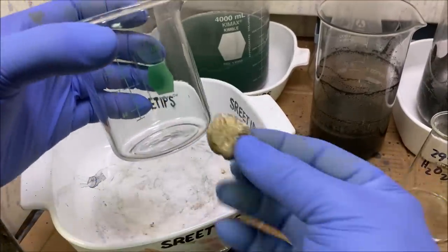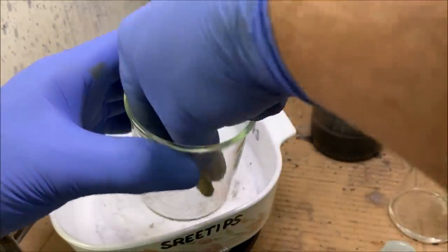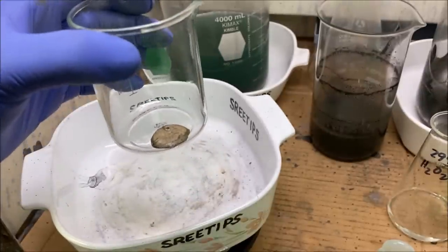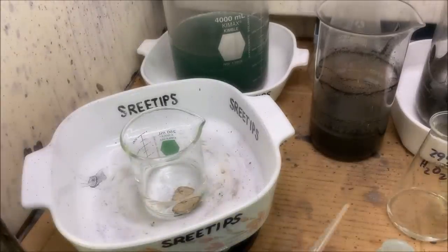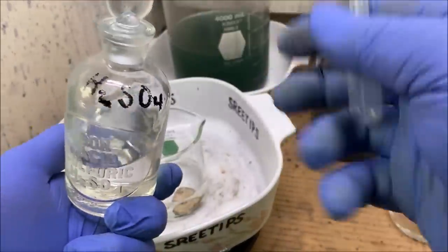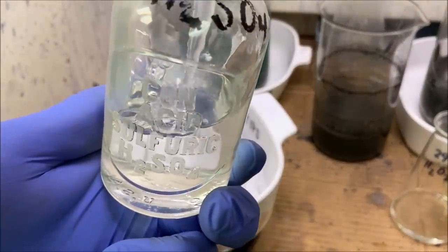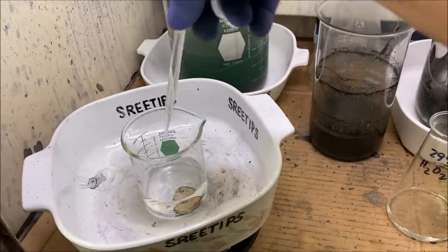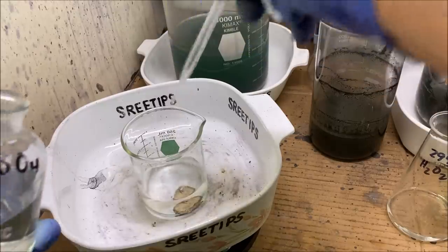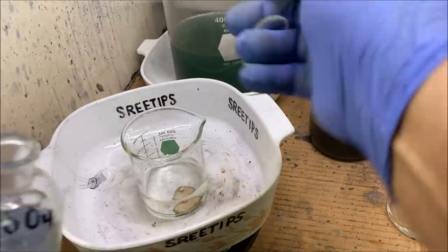So now I'm gonna start working on this button that we melted up in part one. I'm gonna stick it into a beaker, add a little bit of distilled water. I'm gonna turn on a little bit of heat. I'm gonna add a squirt of sulfuric acid, and we'll try to dissolve off the junk that's on that button, get it cleaned up.